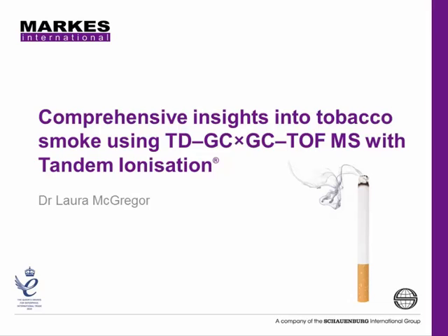This video application note is Comprehensive Insights into Tobacco Smoke using Thermal Desorption Comprehensive GC Time of Flight Mass Spectrometry with Tandem Ionisation with Laura McGregor.